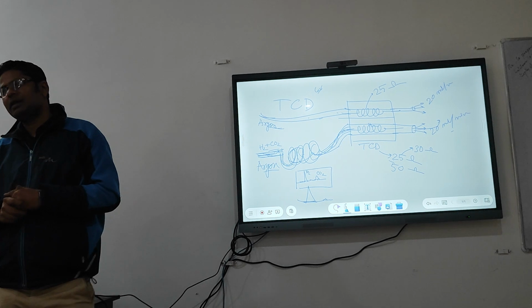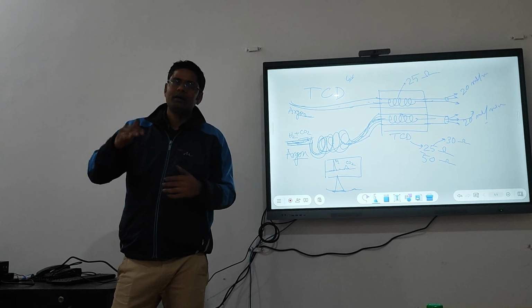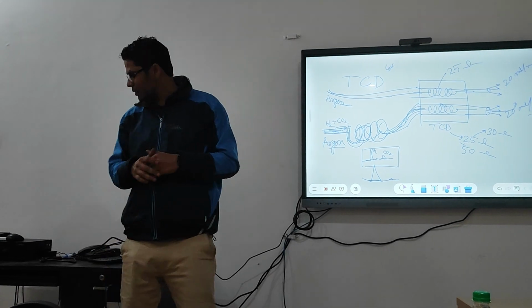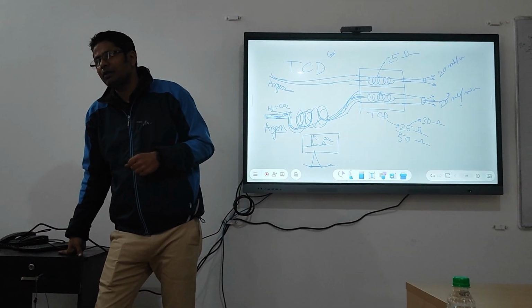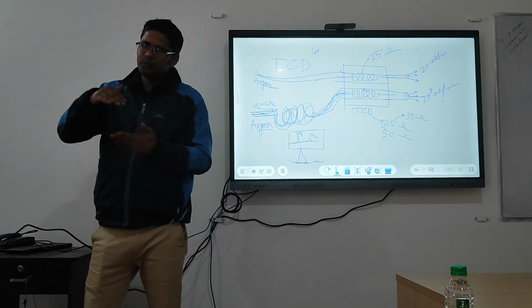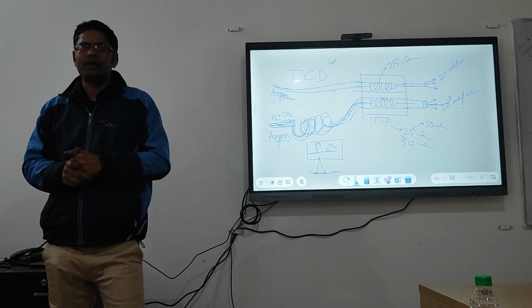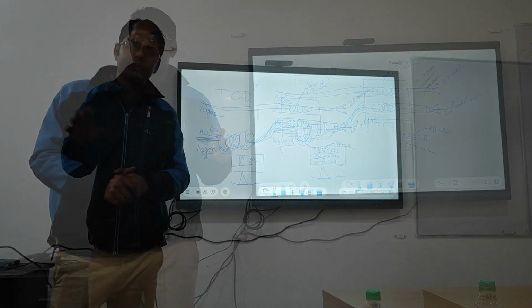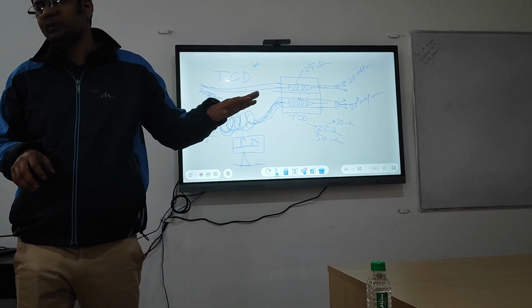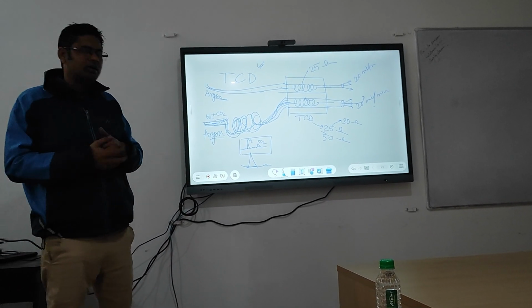In earlier days, it used to saturate. Now all the amplifiers are built so that the sensitivity is divided into 2-3 ranges. If we want to inject 90%, 80%, even 100% concentration, at that time we reduce the sensitivity so that it does not saturate and stays within frame. So you need to know about your components' concentration. You should have some idea of it, but detection-related settings are different for everybody. There I have described how TCD works.